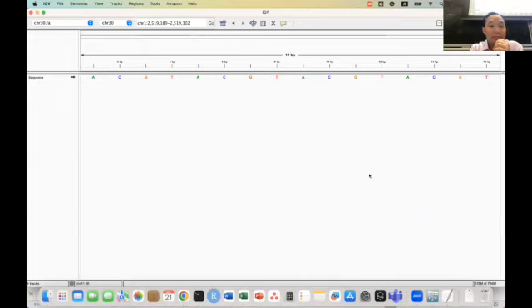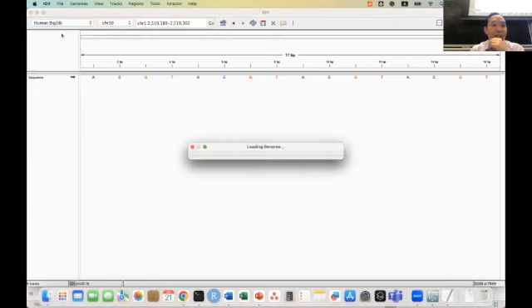Pardon? Chromosome 30 and ACGT sequence. Yeah. So I made an artificial chromosome for an artificial organism, which is a reference genome for that artificial organism. I save it in the FASTA format. And when I upload, it's not the file, it's a genome. So genome, load the genome from file. Then you can upload your custom genome file in this way to the IGV. But let me go back to the human HG38.